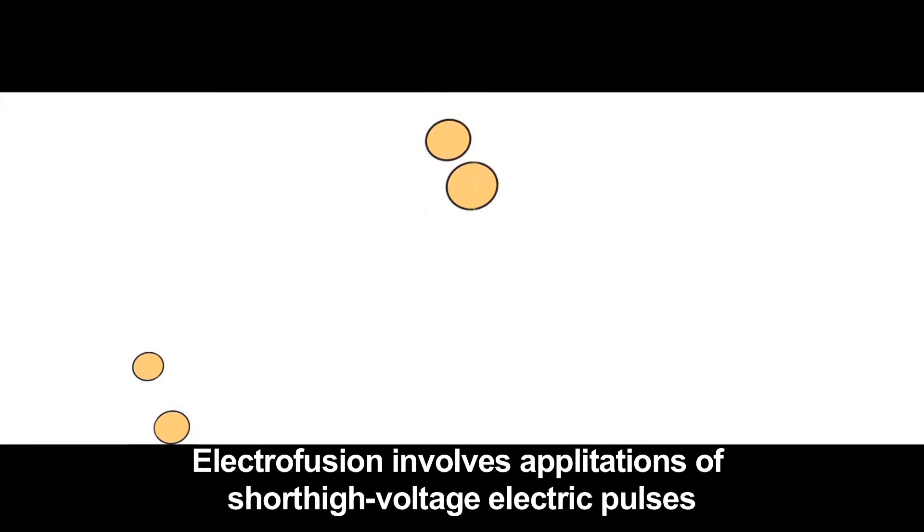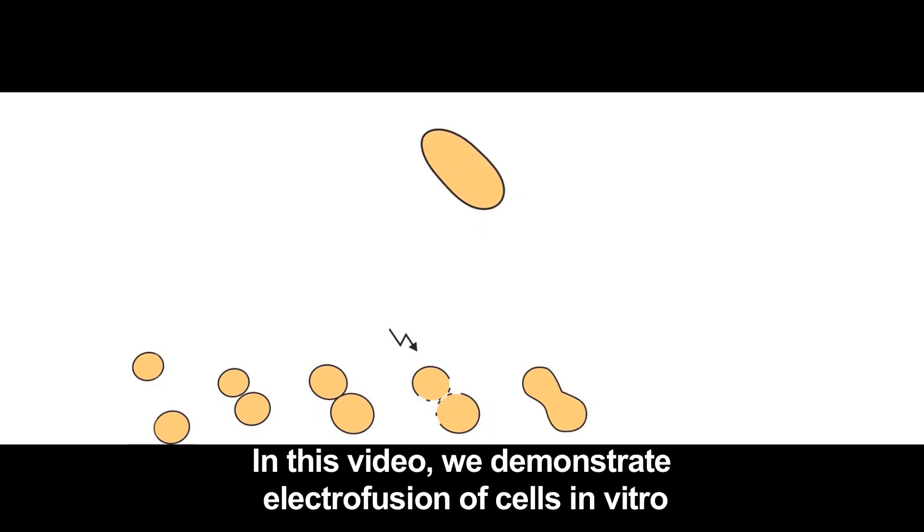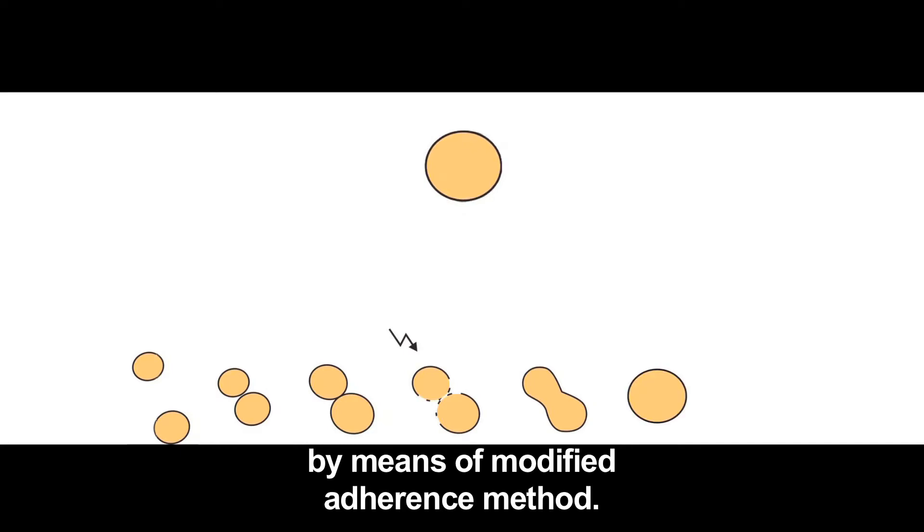Electrofusion involves application of short high-voltage electric pulses to cells in close contact. In this video, we demonstrate electrofusion of cells in vitro by means of modified adherence method.